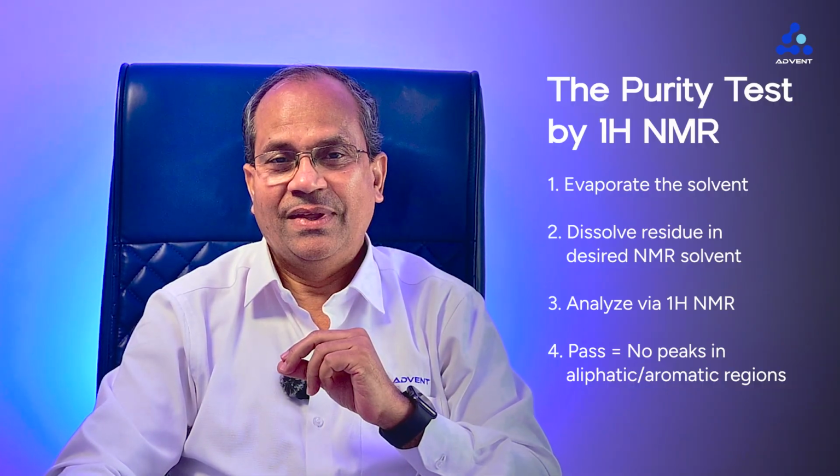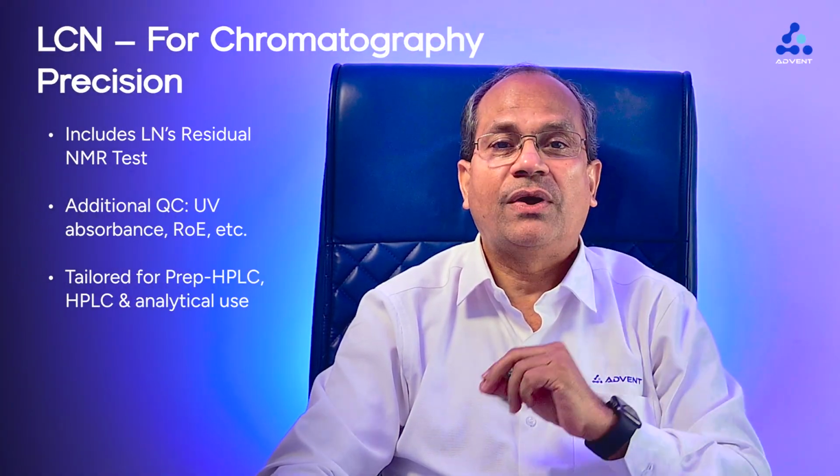Now let us come to LCN, which stands for low non-volatile solvents for chromatography.